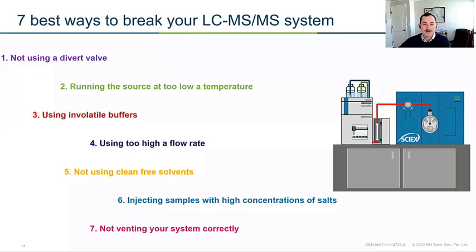So you want to make sure when you're building your methods that you're using a temperature that's appropriate to get your evaporation. And if not, that you're at least using that divert valve so it's not going to your mass spec, it's going to waste when it's more that high or high aqueous content.